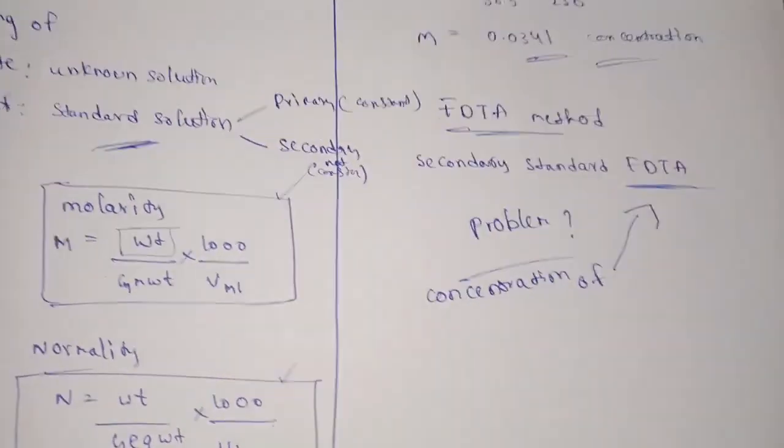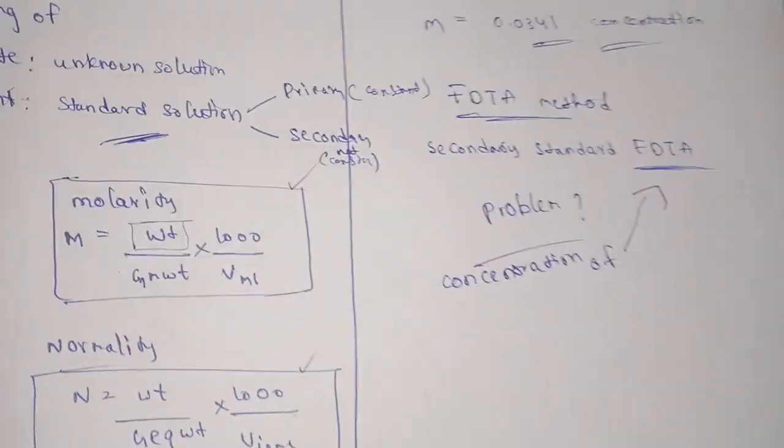We will use the titration method. So I'm briefly explaining the determination of hardness. Now the video starts.